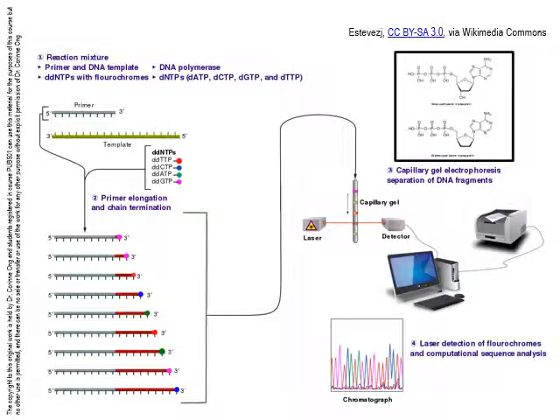The Sanger or dye-terminated DNA sequencing method uses a primer that anneals to the target sequence. Reagents are added to the primer and template DNA that is being sequenced, including DNA polymerase, deoxynucleotide triphosphates, and a small amount of 4 dideoxynucleotide triphosphates, that's ddNTPs, that are labeled with fluorescent dyes in 4 different colors.